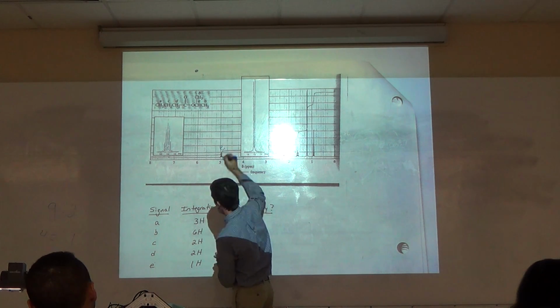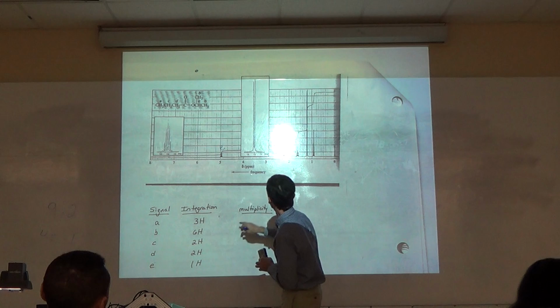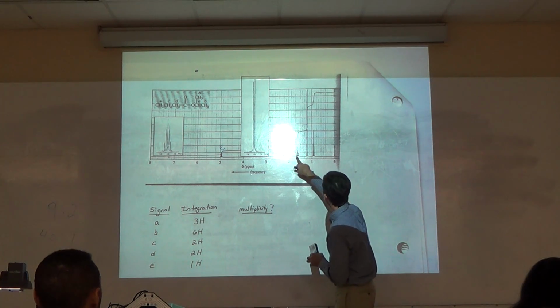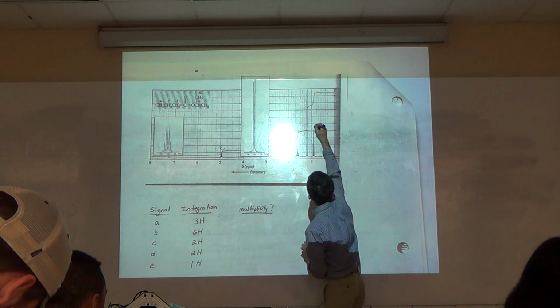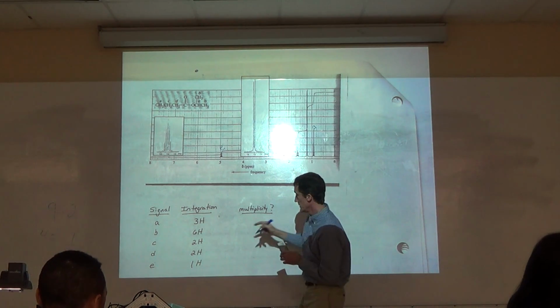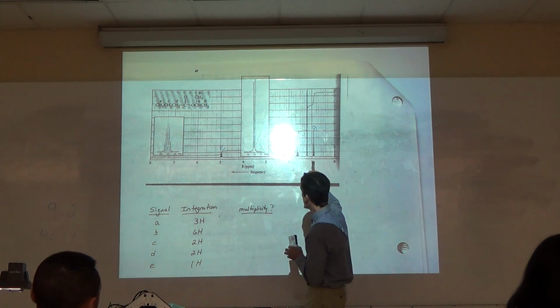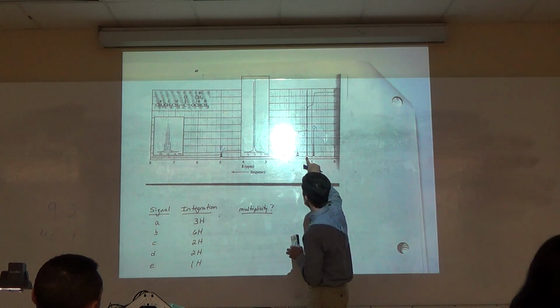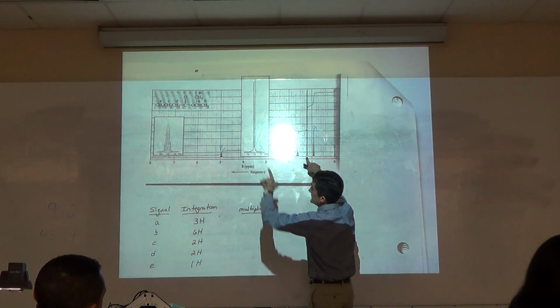That's E, which is 1H, right? Didn't we say that's 1H? Let's skip these two. What's this one on the end? A, which is how many H's? 3. Isn't that what we got with our fingers? This guy here is 6, so it's B, because there's 6 of those.